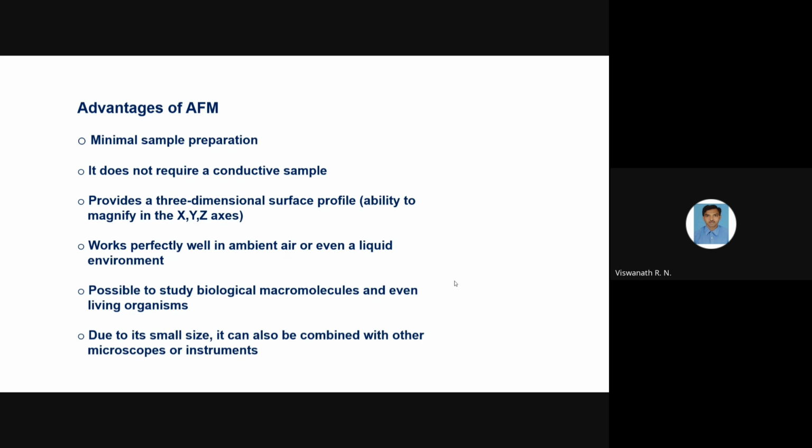That is why the measurement environment is very important for studying microscopic samples. Normally when we put a biological sample in the scanning electron microscope, the electron beam interacts and will burn the surface. But that is not happening here, because here we are only measuring the force in the non-contact mode interaction. So in that way the advantages are there.